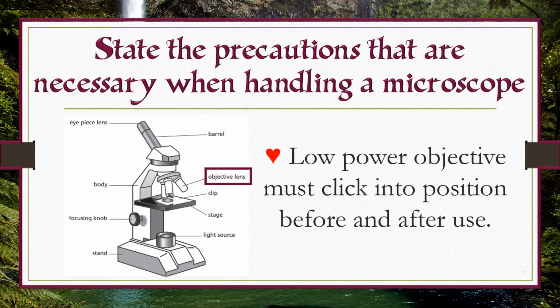Low power objective must click into position before and after use.